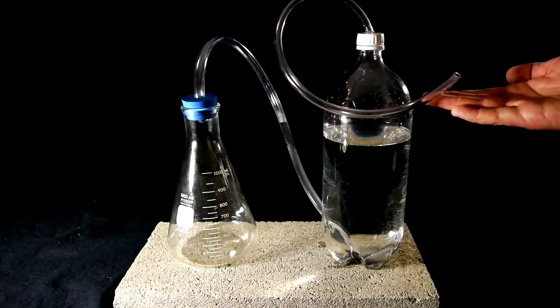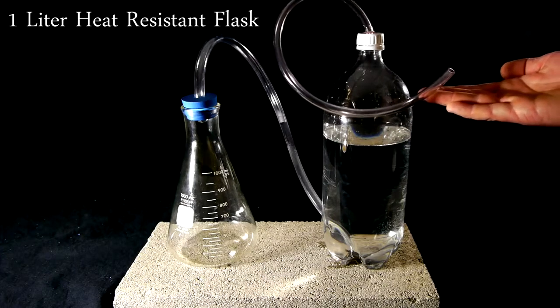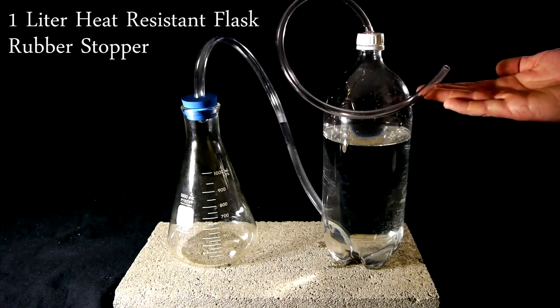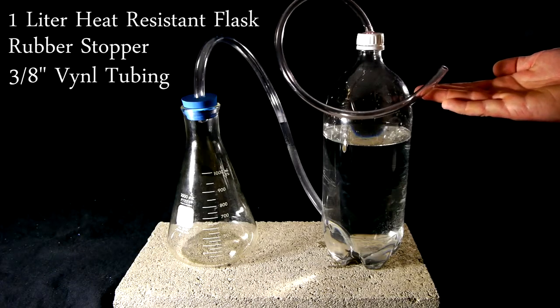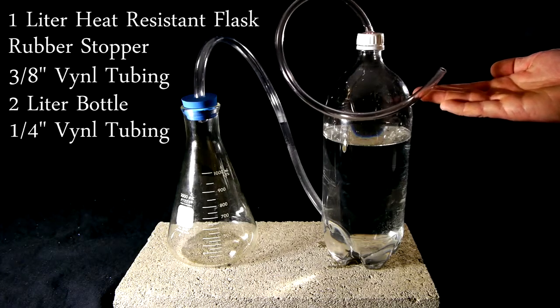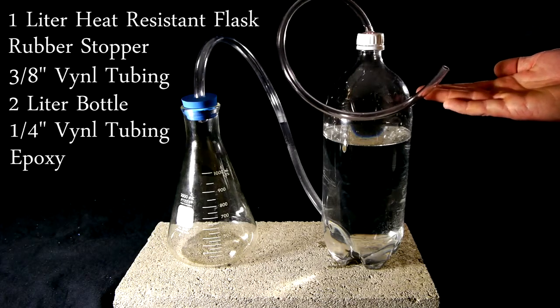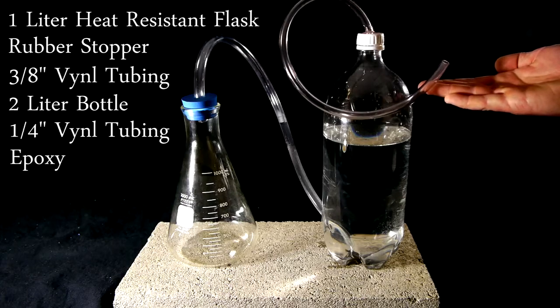In order to create the setup used in this video we will need a 1 liter heat resistant flask, a rubber stopper to fit that flask, 1 and a half feet of 3 eighths inch vinyl tubing, a 2 liter bottle, 1 foot of quarter inch vinyl tubing, and a strong epoxy. The flask and stopper may need to be ordered online but the rest of the parts can be easily picked up at any hardware store.